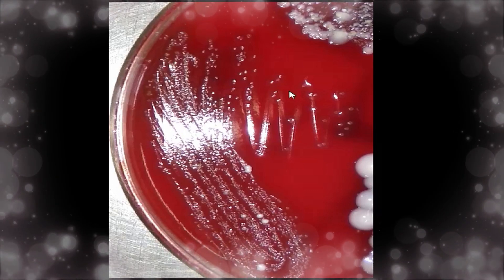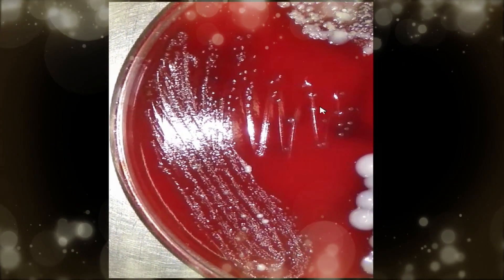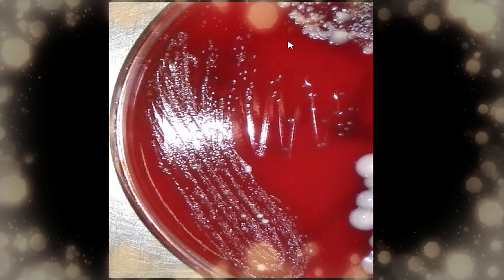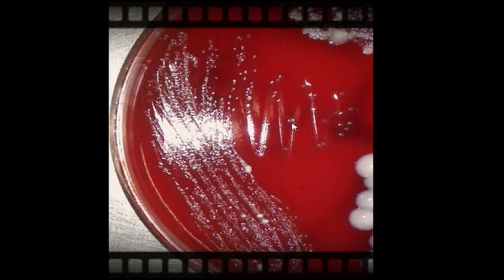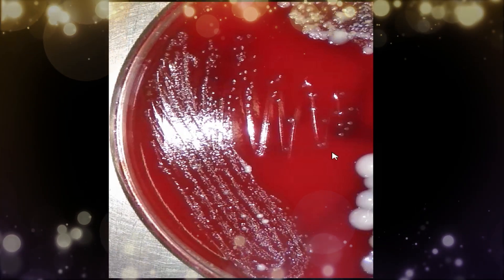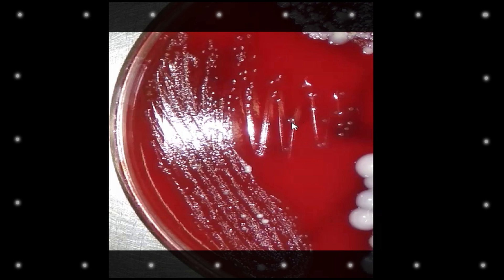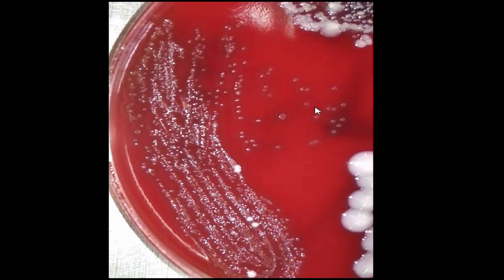Today we are concerned with observation of draughtsman's colonies of Streptococcus on a blood agar plate. Sputum specimens were inoculated onto this blood agar plate, and after overnight incubation, this type of colony was observed. To identify draughtsman's colonies, look for a depressed center with an elevated ring. Try to observe — all of these are draughtsman's colonies.